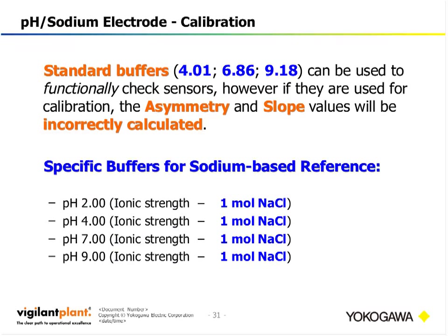Shown here on the slide are just examples of what's actually needed to perform the two-point calibration. However, of course, once the sensor is online, it still may need to have a one-point calibration to adjust the reference to the sodium level of the process.